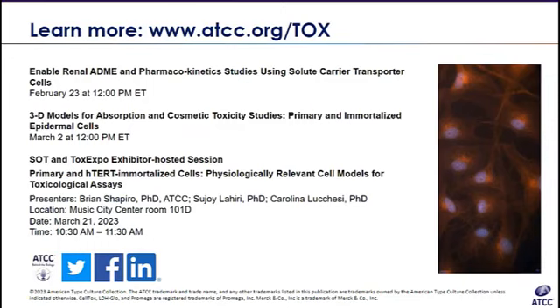One of the cool things about this way to fabricate these models is that you can add additional cell types, not just fibroblasts or epithelial cells, but other things such as endothelial cells, even macrophages as well, to tailor the responses that you want to look at, in regards to the multiple different types of variables that you want to look into.